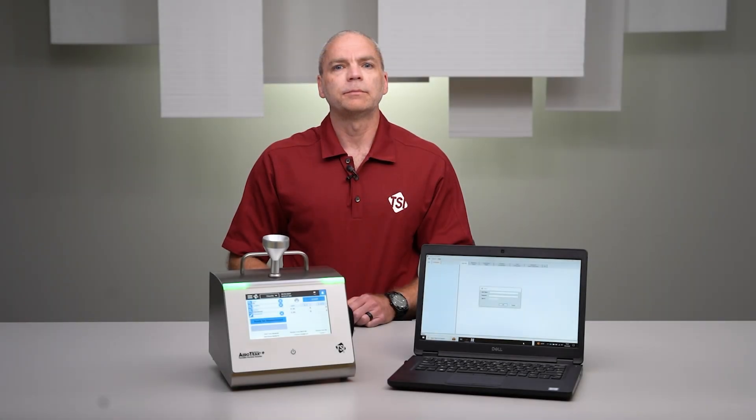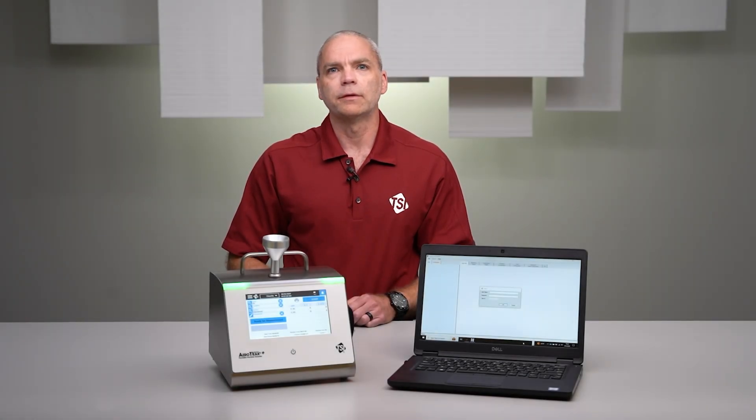Look for additional videos from TSI to learn more about using the Aerotrack Plus with TPLS.